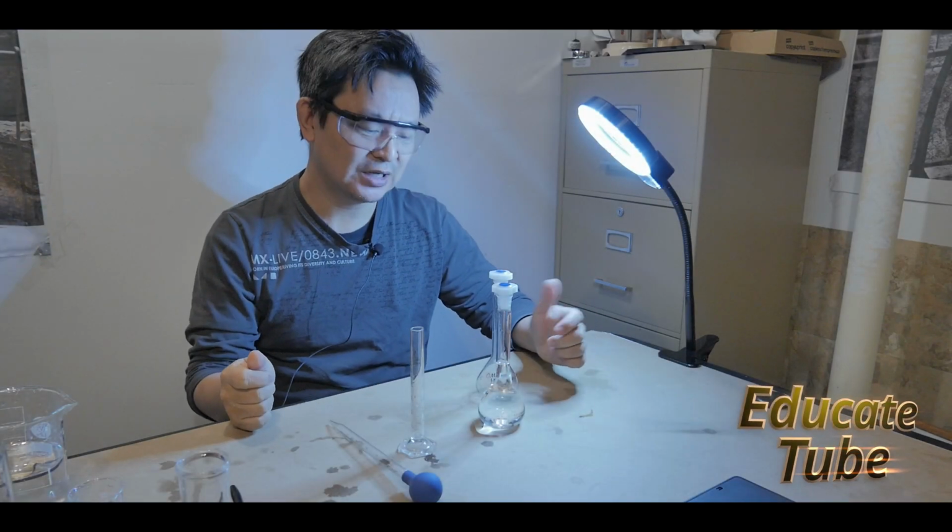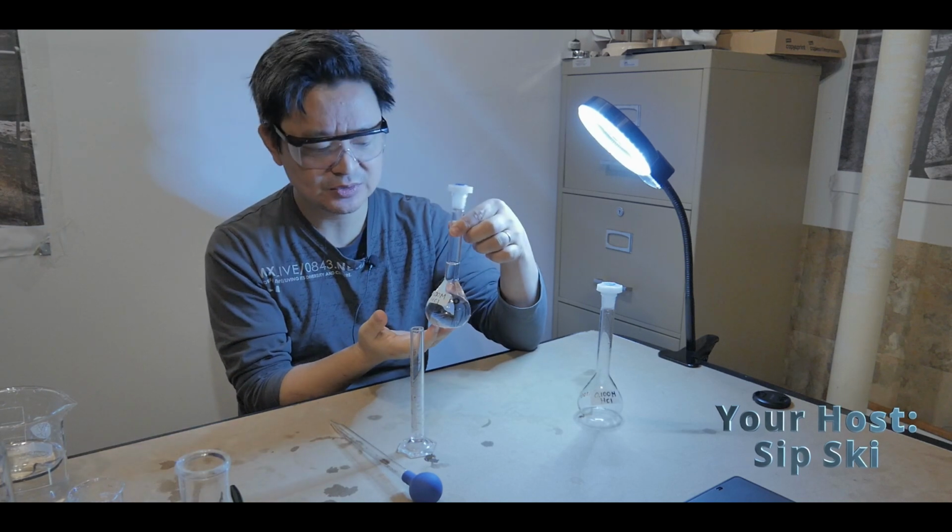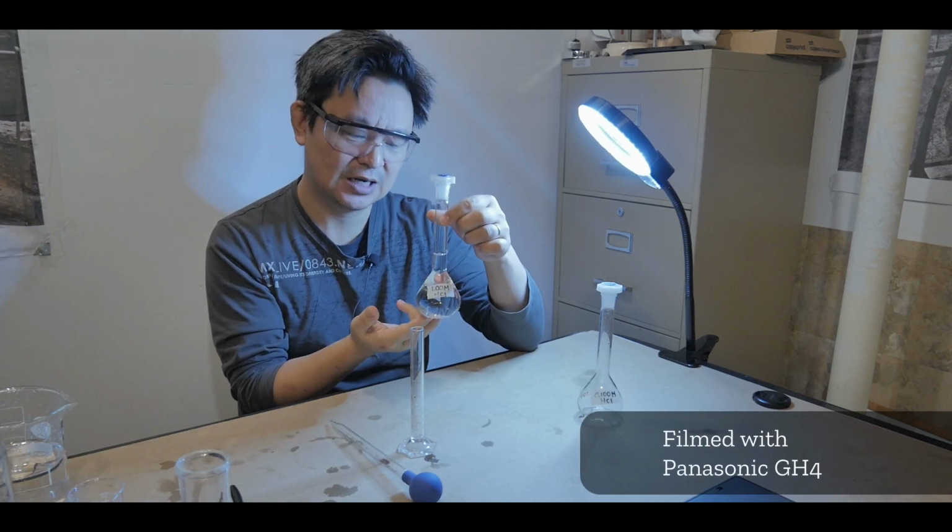Hi, today I'll be showing you how to do serial dilution. So here we have 1 molar, or 1.00 molar, concentration of hydrochloric acid.